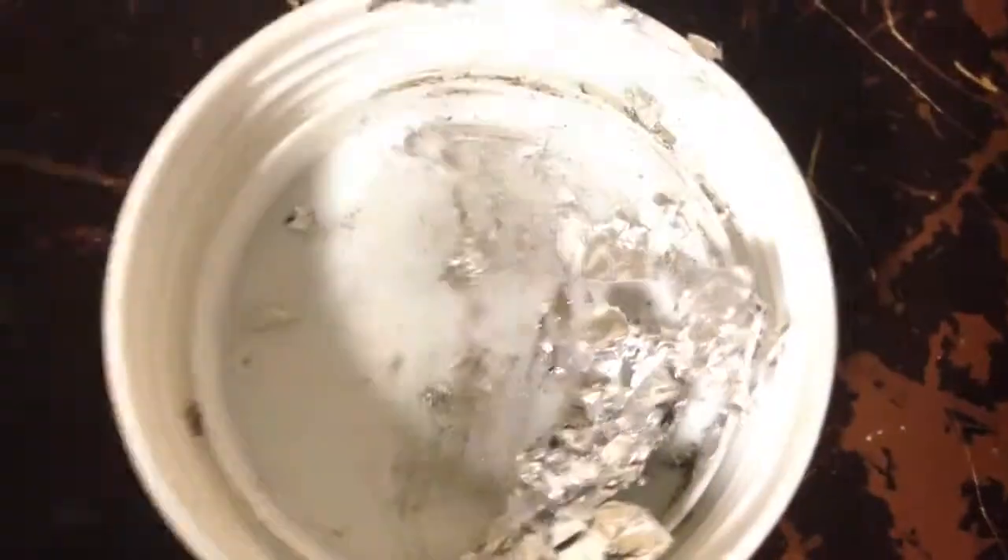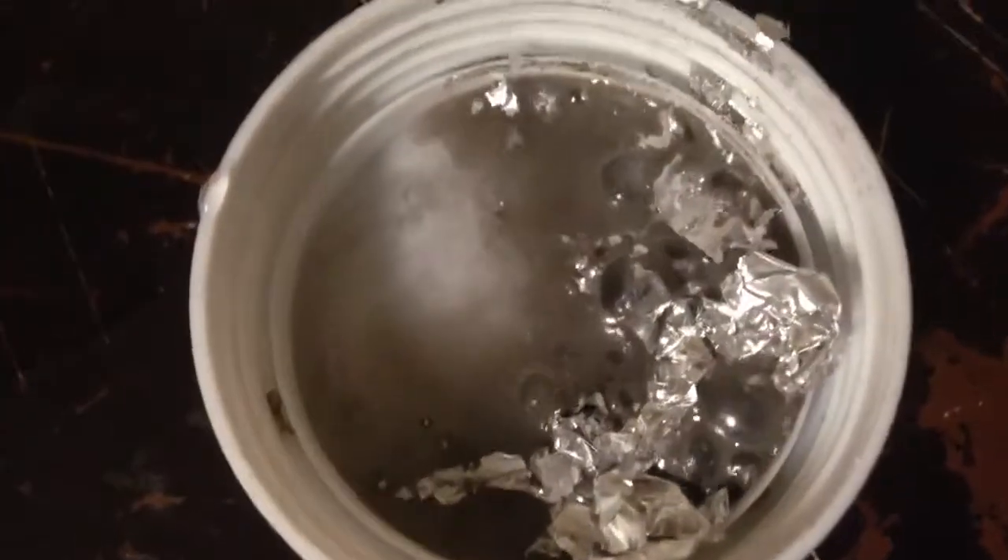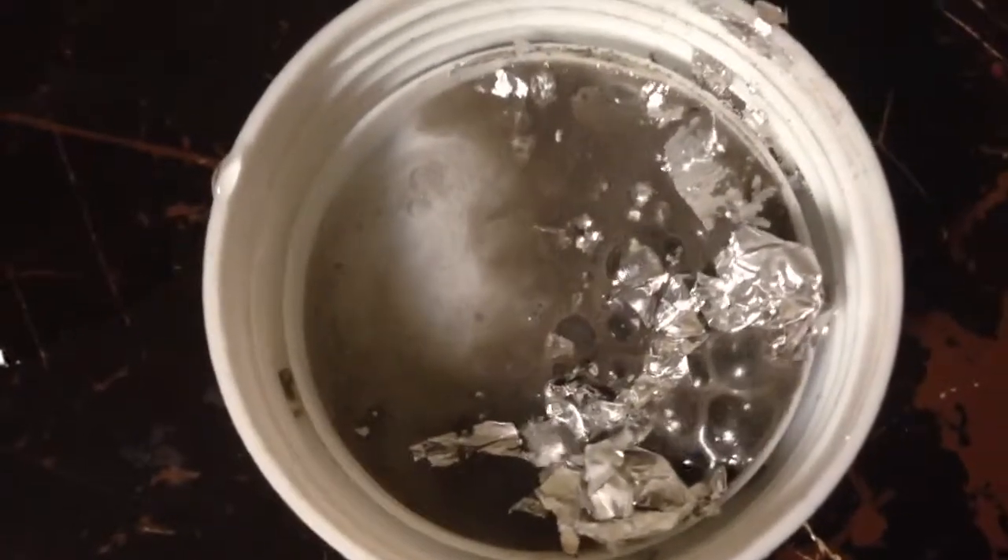Here's another batch that I just scrunched up and mixed with some gallium. Let's put a little drop of water on it and see what happens. It's quite reactive.